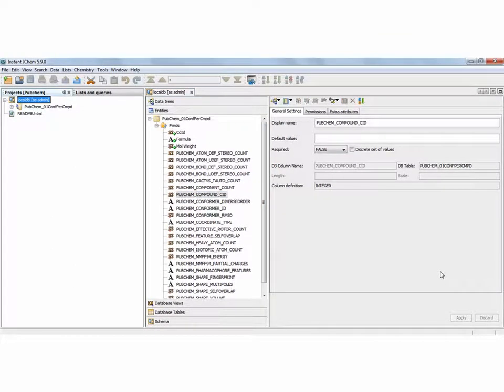For the purposes of this demonstration, we will briefly look at the CSV data that we would like to merge into our main data tree. A sample of this we will set up in a separate entity, which we'll also need to promote to a data tree in order to access a grid view and examine the data.